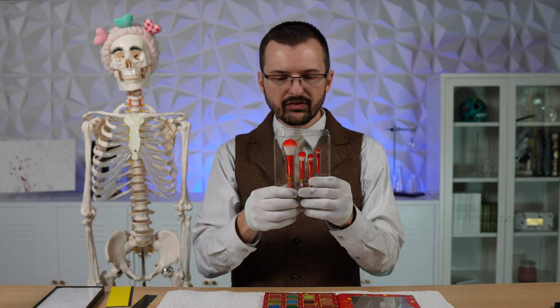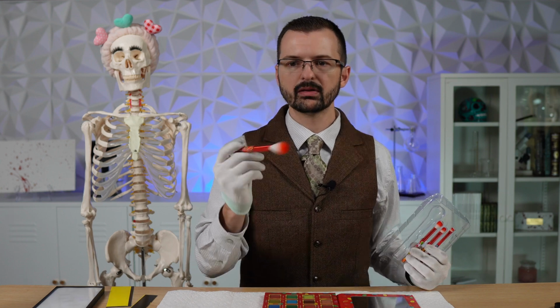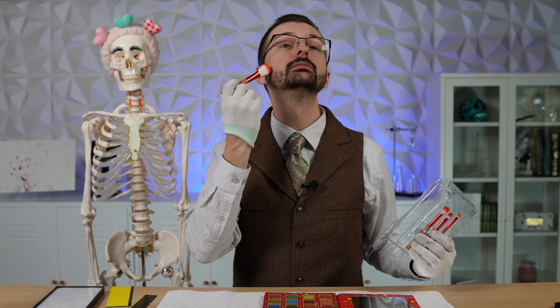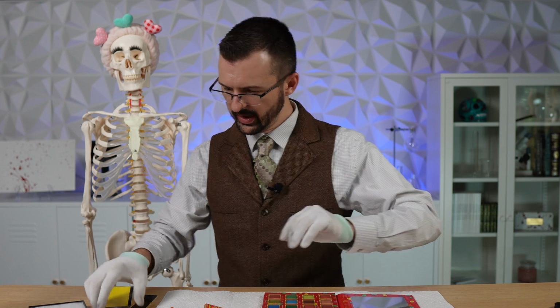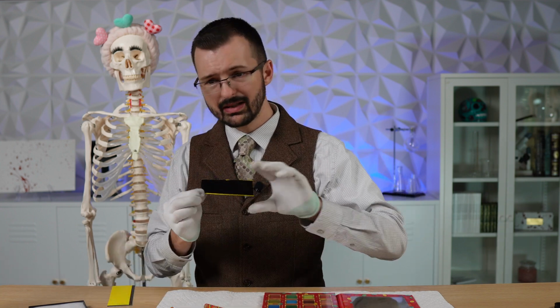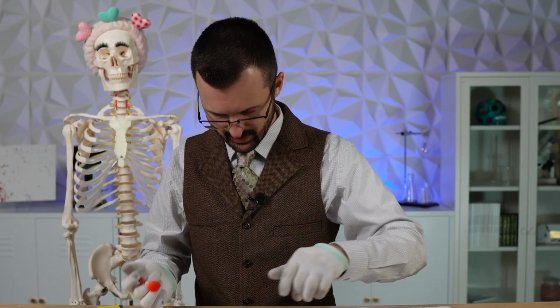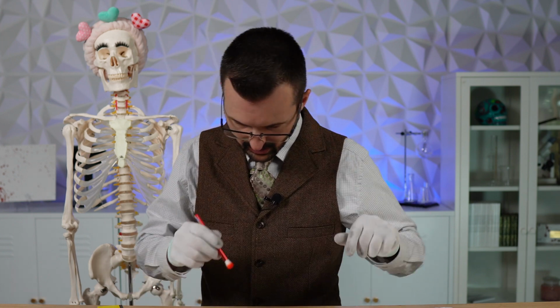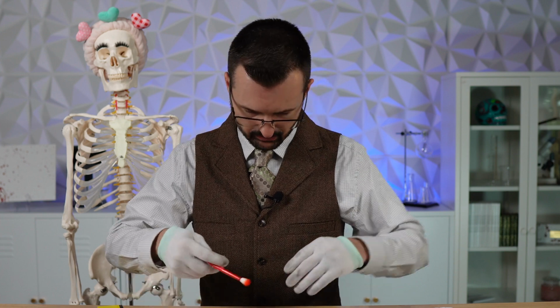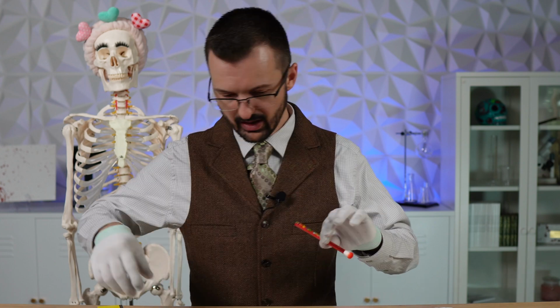We have a variety of different size brushes. All right, so we've got glass. We have a few different colored pieces of plastic so that we can try different contrast. I don't know how you do this. Do you start with a big brush or a small brush? I guess we'll start with a small brush to get it powdered. It's already a powder. You can tell that I don't wear makeup, so I don't know what I'm doing. All right, let's try this one.